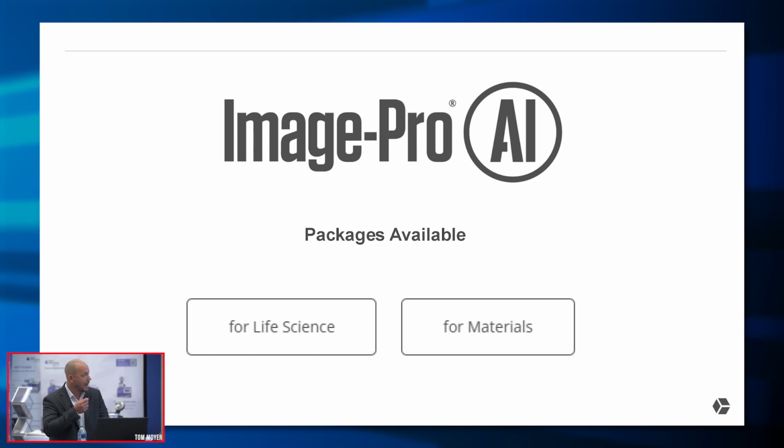I'd like to mention that ImagePro AI, we do have packages available for life science that include our life science pre-trained models as well as the protocols, and the same for materials.